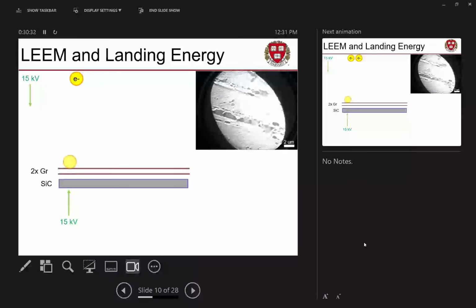And it makes a picture that looks like this. We call this mirror mode. It's very bright because we're basically staring back at the electron beam the whole time, because we're bouncing it off the sample, but there's texture in it. You see all these little fizzy texture details. And that is because the sample is, of course, not perfectly flat. It has some stuff on it, because there's usually no point looking at a perfectly flat sample of one material. And the stuff on the surface of the sample modifies the local electric field lines. And that in turn changes the mirroring effect that this has on the electron beam. And so we get some texture. Okay, that's nice. But that's not what we're here to do. We're here to actually learn something about the material, not the electric fields around it.